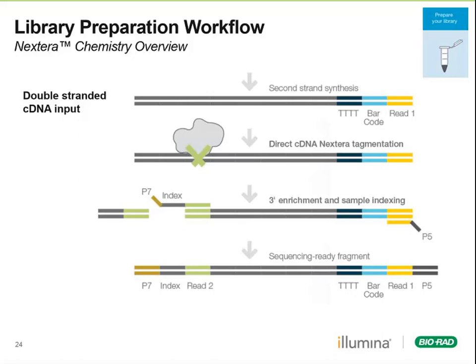If we look to the right side of the cDNA insert, we see the poly T region or poly A region. Then we see a barcode. That's the cell and transcript barcode region. And then we've actually already added the read1 adapter at this point. So we're going to be using a modified Nextera transposome to do the rest.